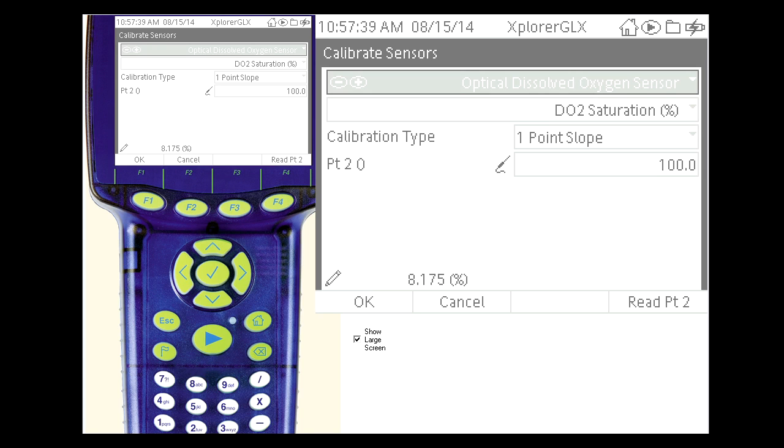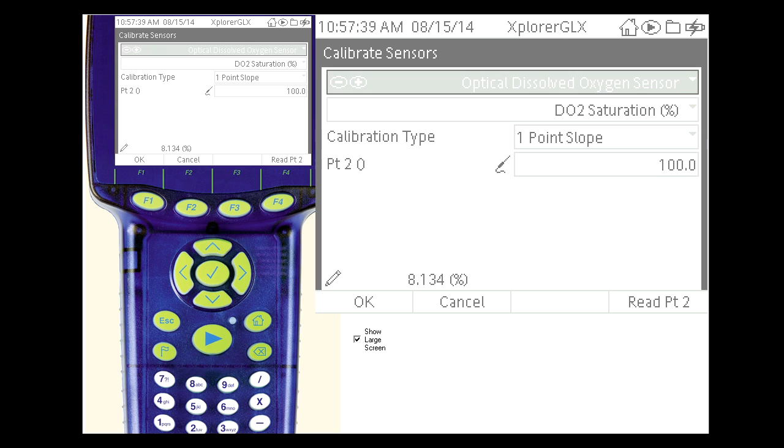When the value has stabilized, select Read Point 2. The sensor has now been calibrated and we can proceed with the lab.